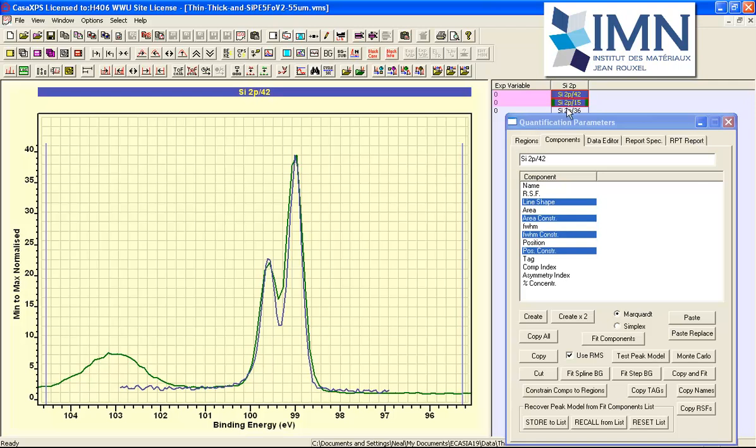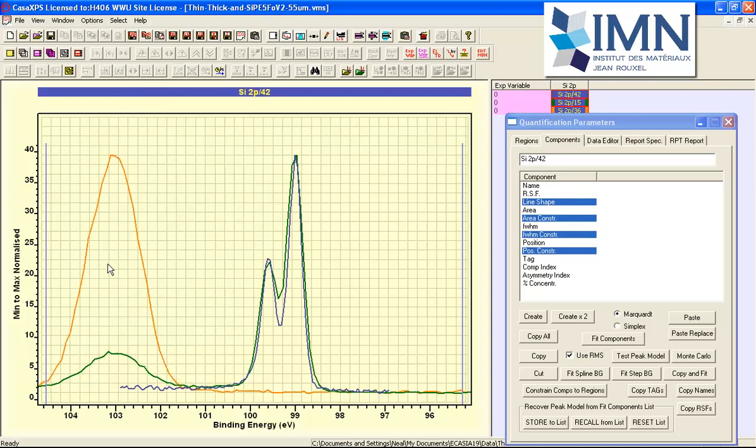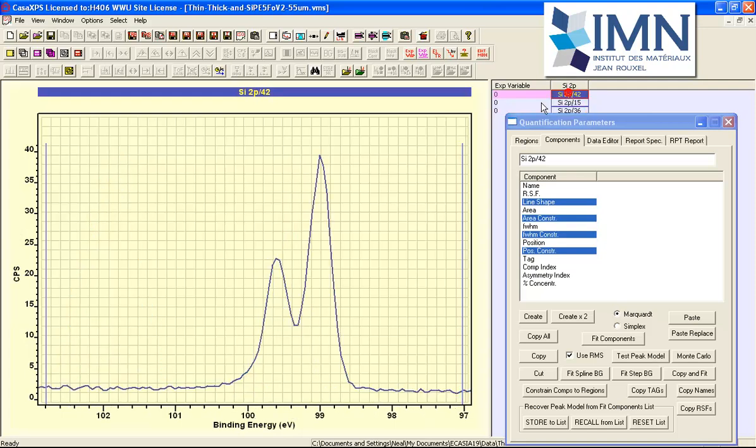So finally, let's just do a comparison against another spectrum, and this one is thick oxide on a silicon wafer, so thick that we see almost no evidence of the elemental silicon, and we simply see an oxide peak, and its position and its shape are very similar to this thin film. So it looks like the blue spectrum is indeed from elemental silicon, and there's no oxide that would be associated with a film of silicon oxide on this wafer.